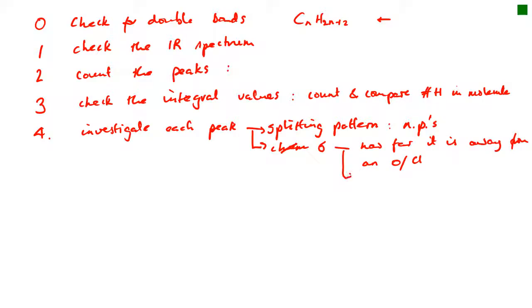But in your alternative, and I think in these exam questions, it looks like you're more expected to use table B in the data sheet. So, if the chemical shift is 1.1, you look at 1.1 up in the data sheet and see what sort of proton that is. Okay, so we'll write that down as well, versus table B of the data sheet to check what type of proton it is.